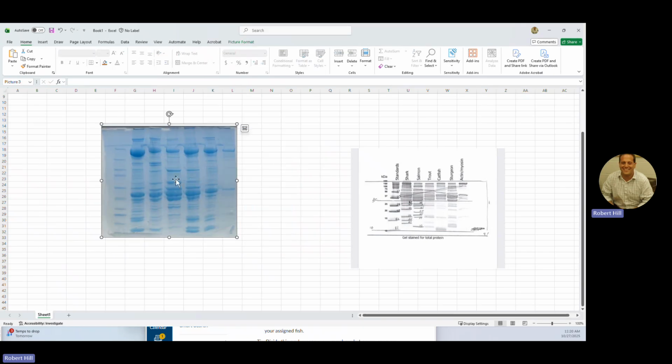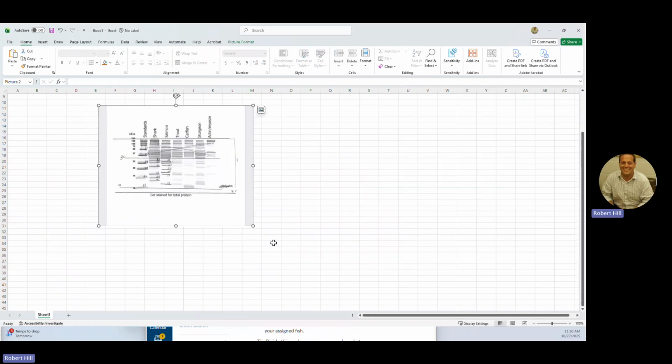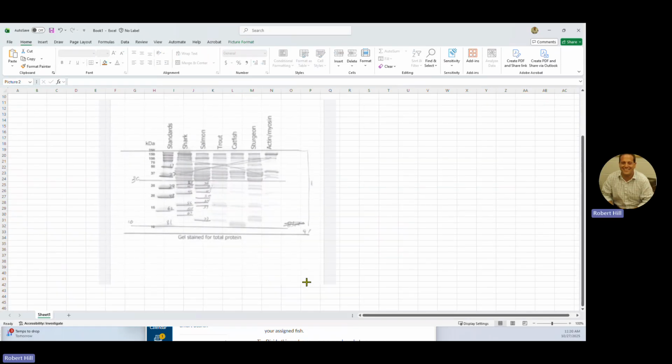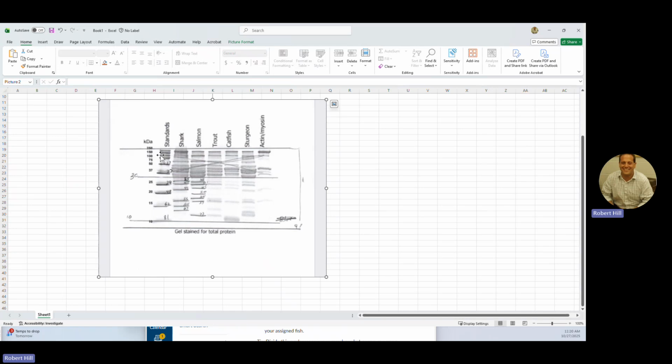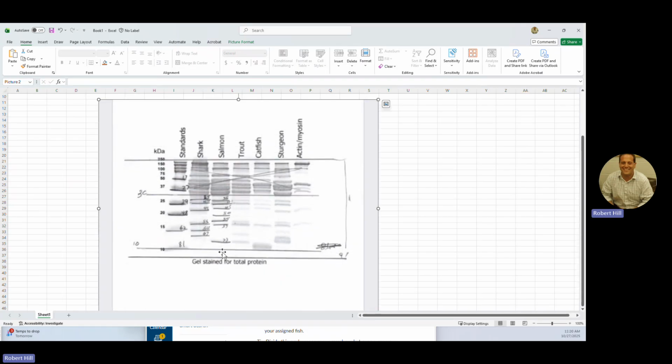And I know some groups are saying, no, because I was going to use that one. Oh, you're going to have to do it yourself. And I'm going to use this as an example moving forward. All right, so I've printed this and I've labeled some things here. First thing, when you have a fat band like that, generally what people do is measure the band at the bottom of the fat band.